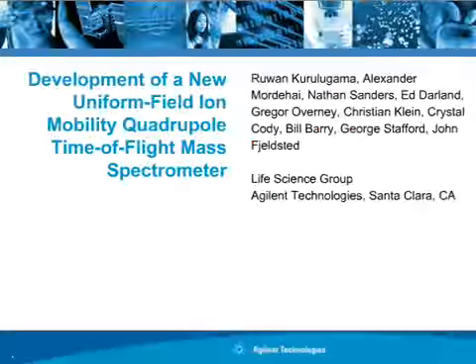Thank you, Tamlin. This is George Stafford, and I'm delighted to be here this morning. You can see the title of my talk on the first slide is Development of a New Uniform Field Ion Mobility Quadrupole Time-of-Flight Mass Spectrometer. What I want to try to do today is take you through our objectives and how we developed this instrument and how excited we are about the types of information and data that we're obtaining.